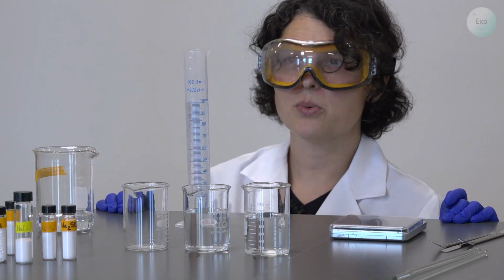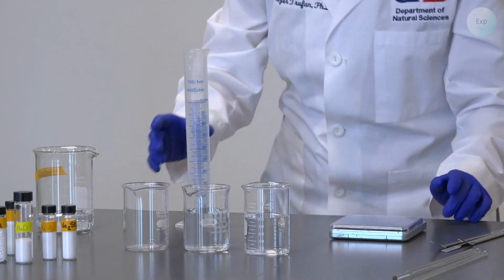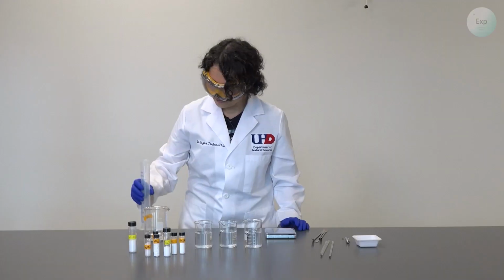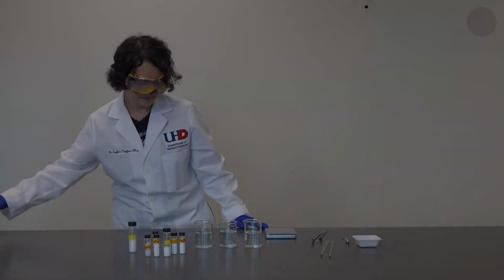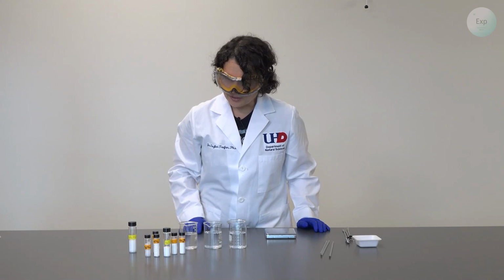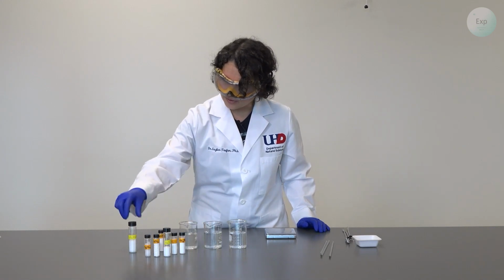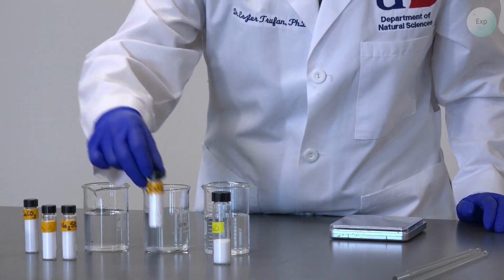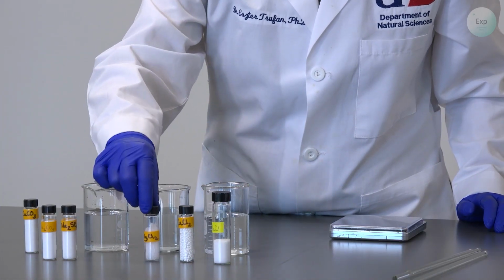And for our third measurement, we are at 99.8 milliliters. With this, we're done with the water. Next, we select our chemicals that we want to work with. And for this experiment, I am going to work with the chlorides. I have sodium chloride, calcium chloride, and magnesium chloride.